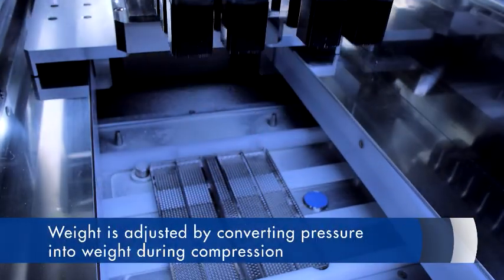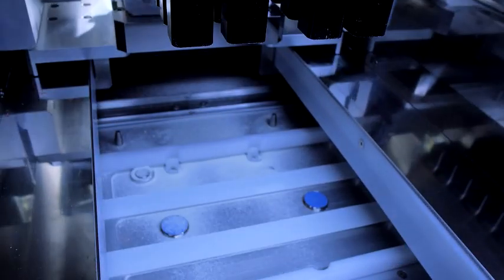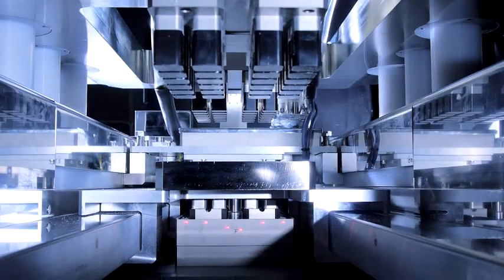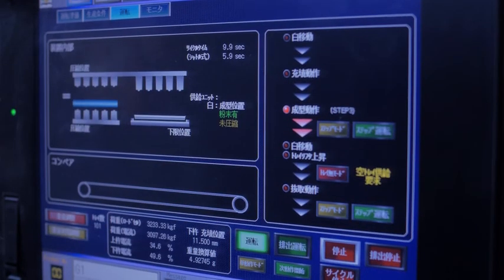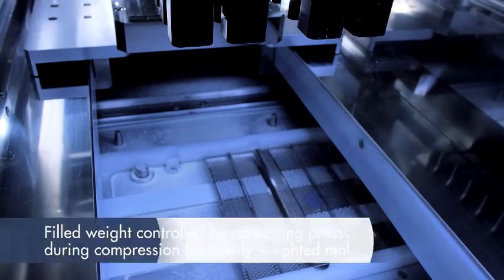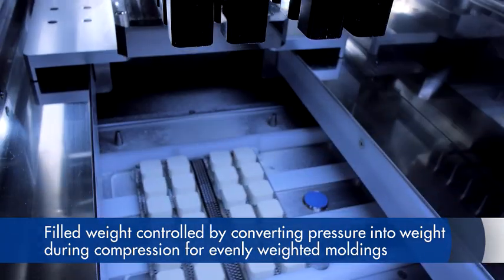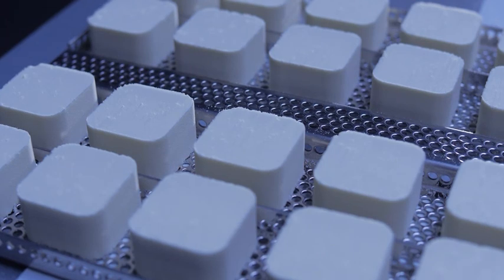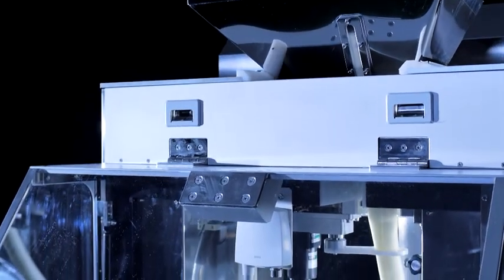Product weight is adjusted by calculating the proportional relationship between weight and compression force. Compression speed can also be adjusted in multiple stages. This facilitates improved production capacity, creates harder moldings, and produces more precisely sized moldings. The filled weight is controlled by converting pressure into weight during compression, enabling the production of evenly weighted moldings. The HPTM EX provides users with the ideal tool for manufacturing easily dissolved stable moldings at uniform weight.